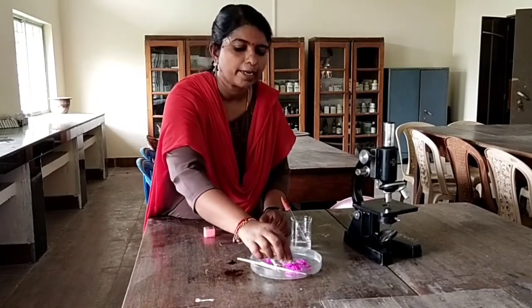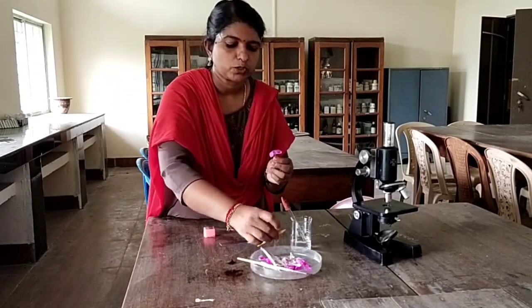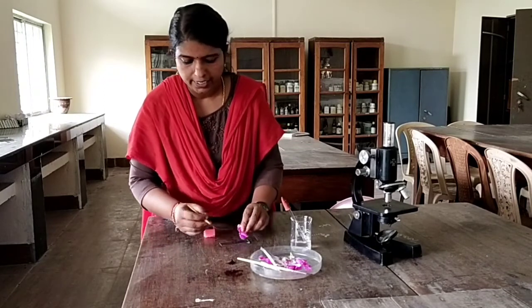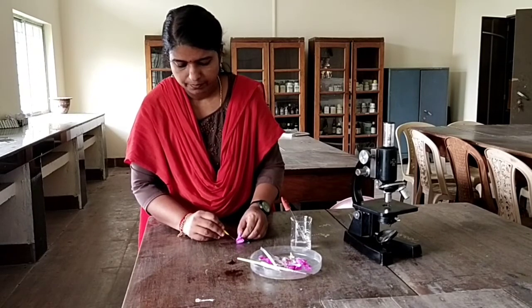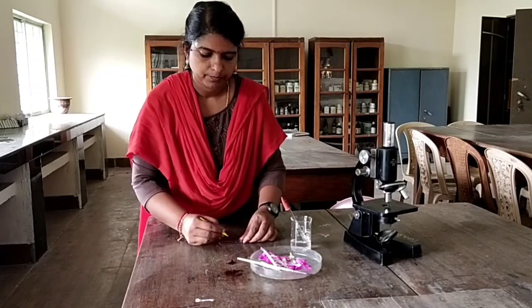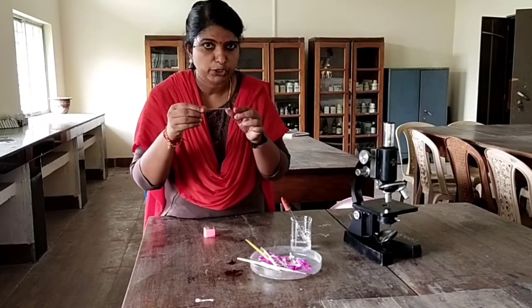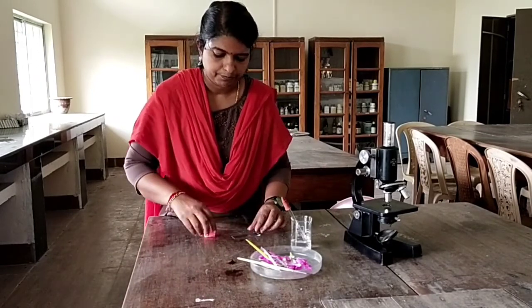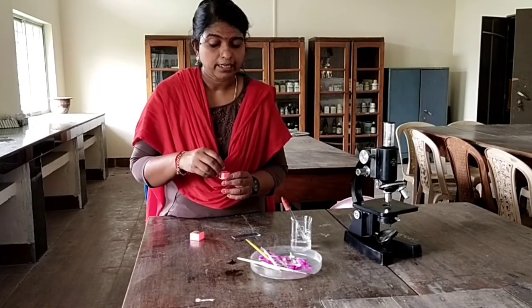Here I am taking the flower Vinca Rosea. Just open the flower and dust the pollen grains into the nutrient solution. Now I have dusted the pollen grains in the nutrient solution. After that, cover this with a coverslip, taking care to avoid air bubbles.